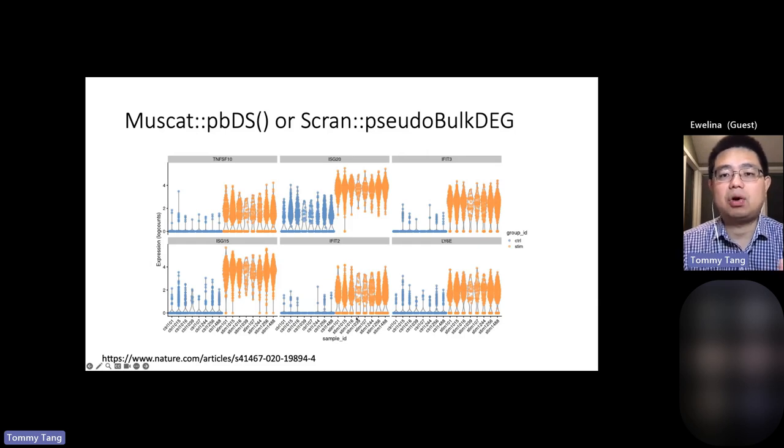If you only show two violin plots in a paper, instead of showing every sample as here, and treat each cell as a replicate, you are likely to see a really tiny p-value, as I mentioned before, but then the heterogeneity within the group is masked. If you just group all the cells together for two groups, the difference could actually be contributed by a single sample.